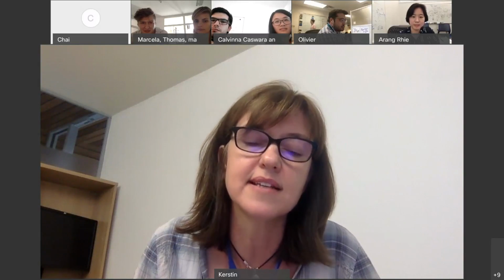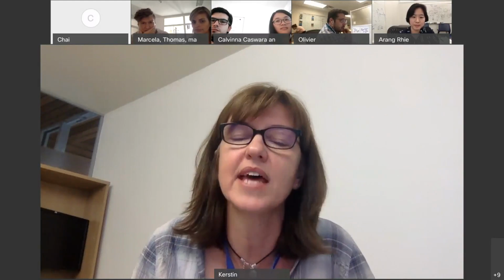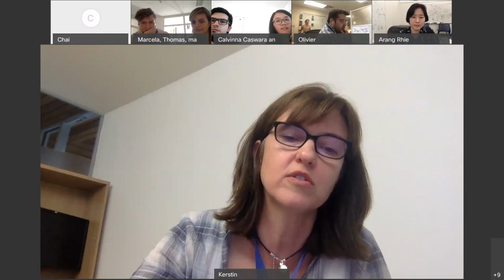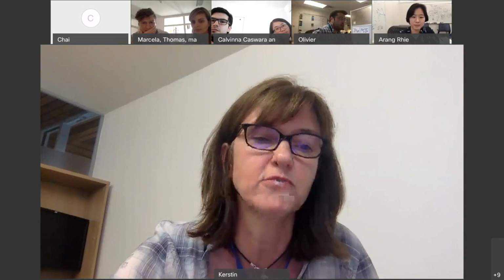We are using HiGlass to view the Hi-C maps, and Ed in Richard Durbin's group has recently created some software called PretextView, which I personally find really excellent because it's fast, very slim, and allows shoving data around. So you can actually apply whatever changes you want to your assembly in there. That might be a nice contender for looking at Hi-C maps in the future.